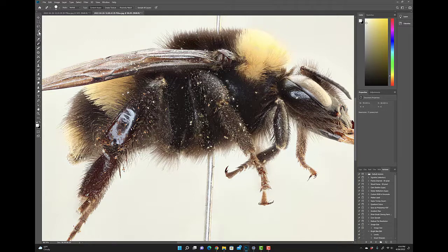So once that's done, now what you can do is start to select an area. So we're going to select this area right here, which has a bit more glare, and this is the part that we're going to focus on. Now, if you were to edit the area that is being selected and edit that area alone, you're going to have a really sharp band of contrast around the border, the area that's been selected, and it's going to look really goofy when you're all done.